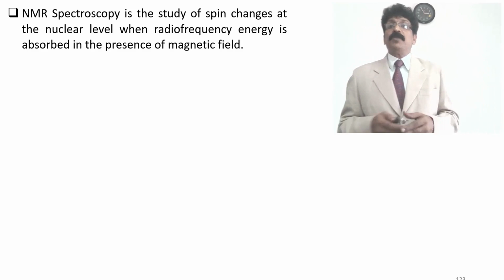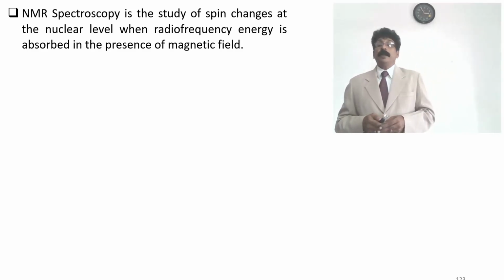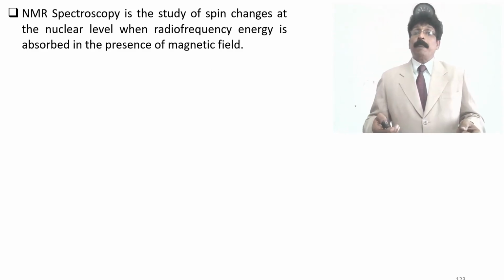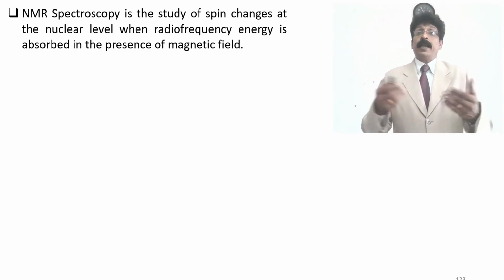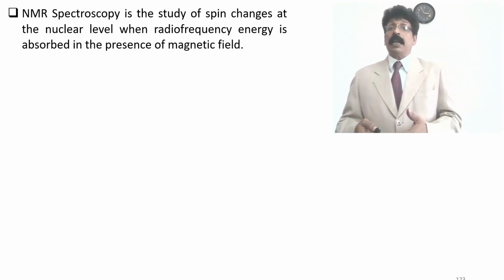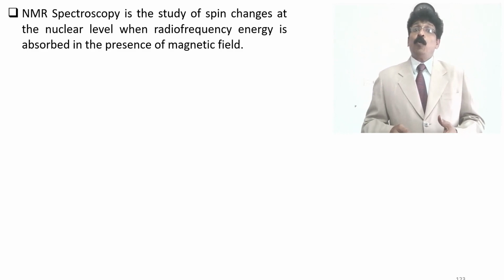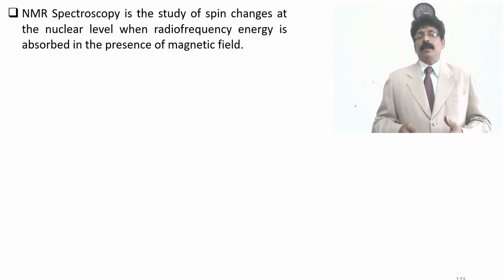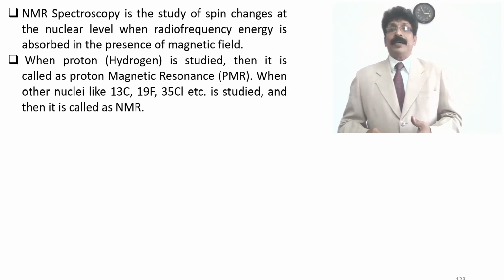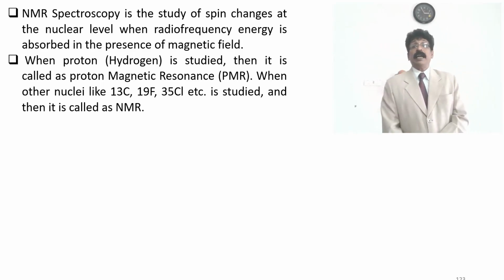This gives you a band or a graph, a result in which the change in radio frequency energy in the molecule can be detected.